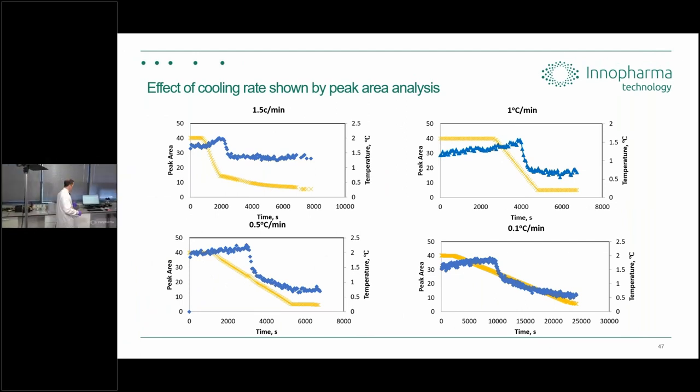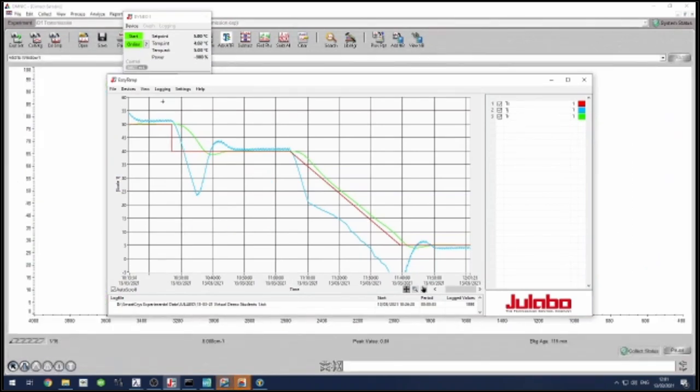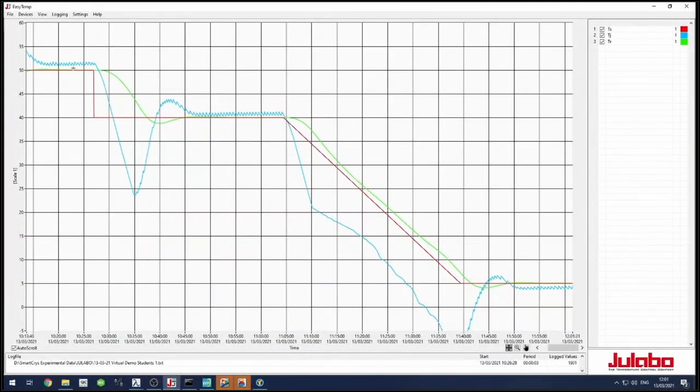So I'm going to go back over here to where the Julabo chiller is in action and has been throughout the process. What we're seeing here, there are three different measurements coming from the chiller. One of them, in red, is the set point. Initially it was set at 50 degrees. Then it was changed, this was all recipe driven. Sorry, I realize I've neglected to close my presentation so that we can see this. And for those of you on the web, I think now you can see a much better picture, I hope. Okay, so what we're looking at here in red, if I make this full screen, that will stop the clutter. You can see how this was controlled.